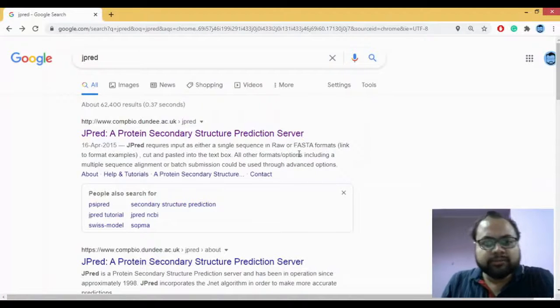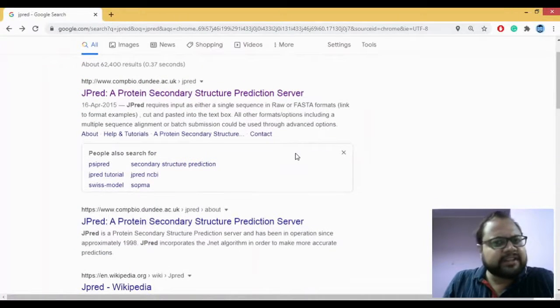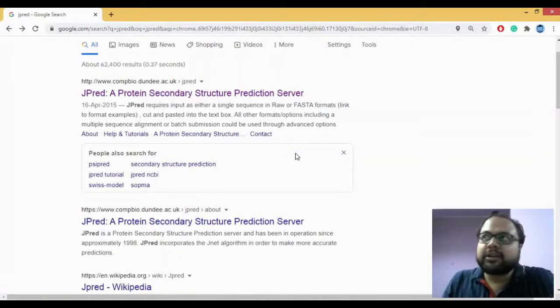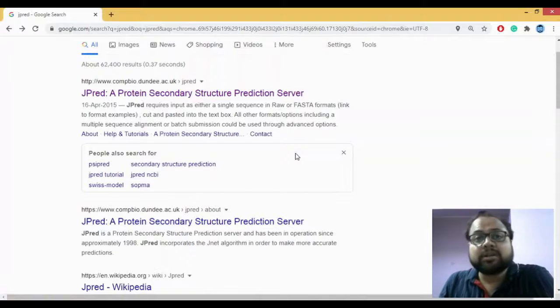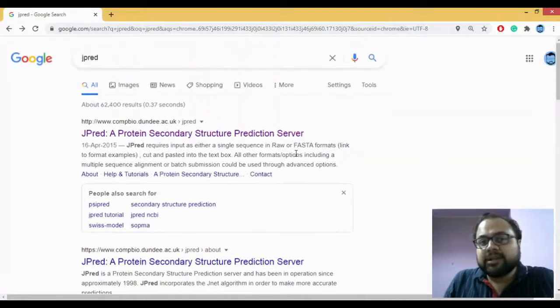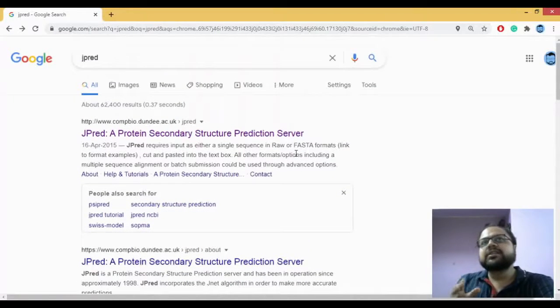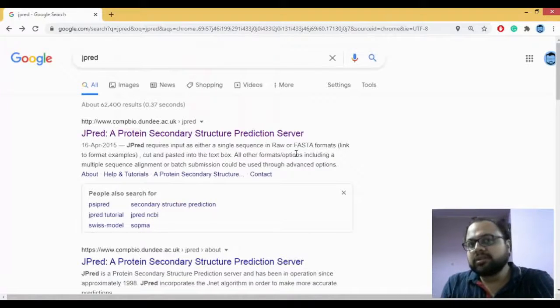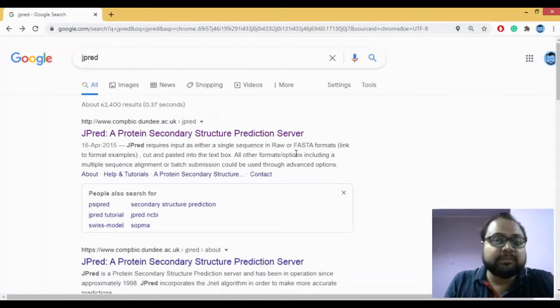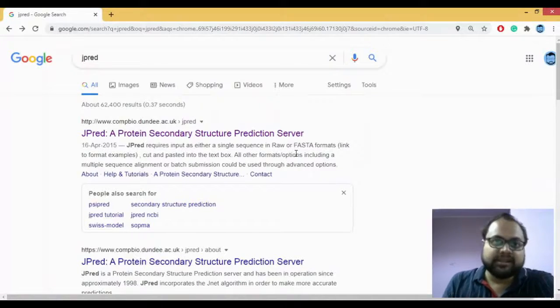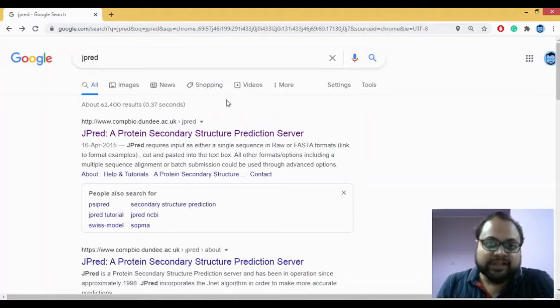One interesting thing about JPred is that it's also able to predict solvent accessibility and also coiled coil prediction. What it does is it matches your query sequence with the known sequences present in the database, so it basically does a sort of PSI-BLAST in order to do the matching.